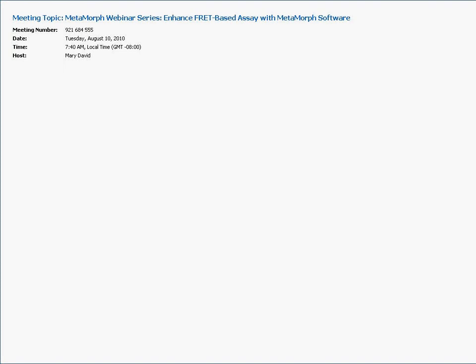Also, Alfred Hernandez asked, is FRET supposed to be seen as bright dots in the corrected image? In the corrected image, yeah, the brighter the intensity that you have, the more FRET that's going on. But again, that's just a qualitative value for the correction.